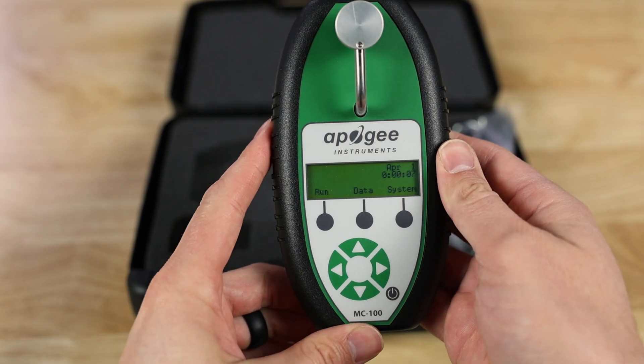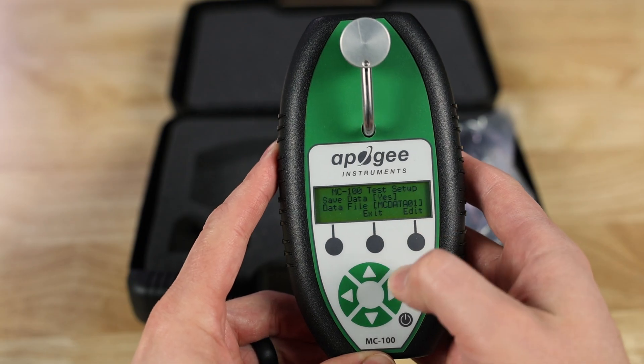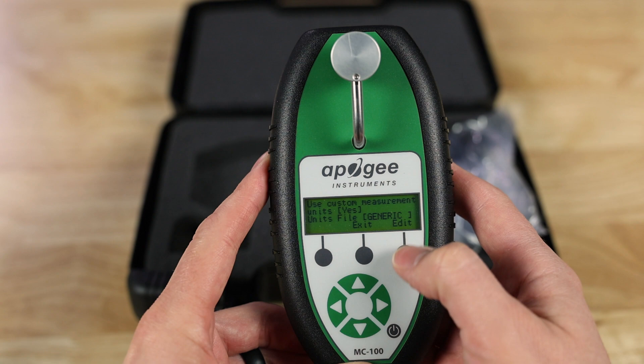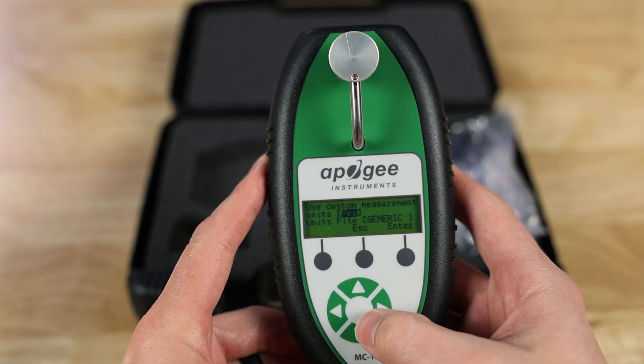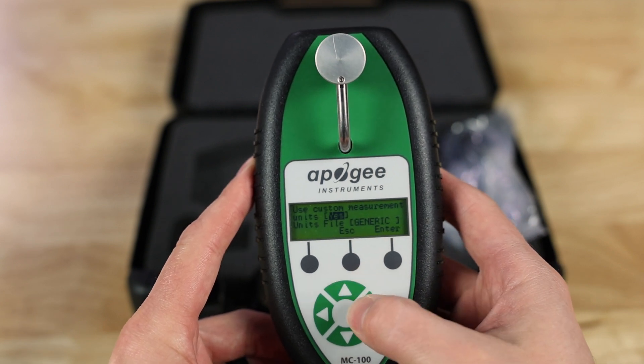From the main home screen, press the Run button, then to select your species press the Setup button. Press up through the menu and you'll have a screen that says custom measurement. If you want to measure in CCI units, change that to No; if you want chlorophyll concentration or SPAD units, click Yes. To change it, click the Edit button and then press up or down.